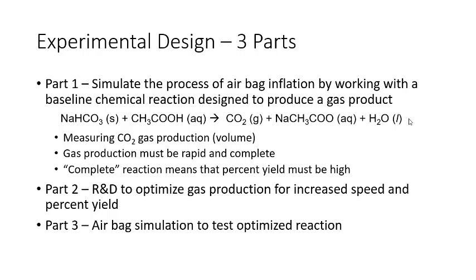In part 3, you're going to move on to our airbag simulation, where you're going to test this optimized reaction using a Ziploc bag. You're going to scale up the reaction, mix the reactants together, and see how fast and how completely you can fill up that Ziploc bag.